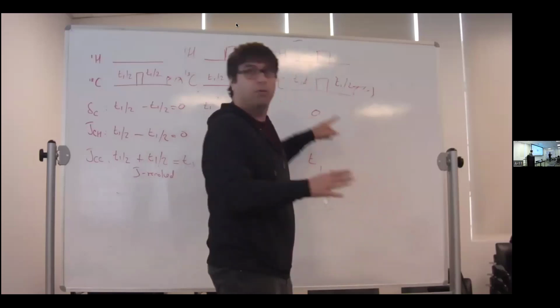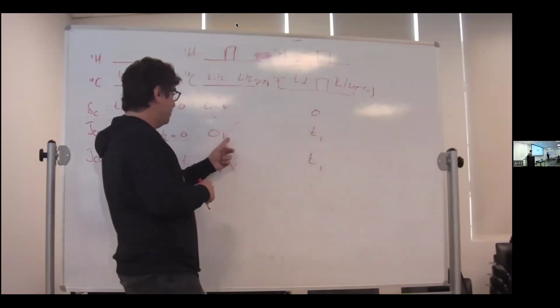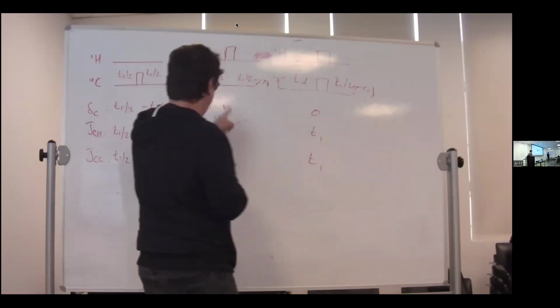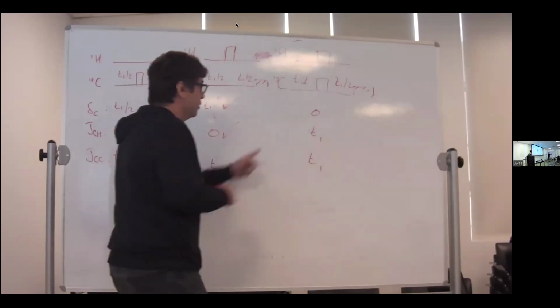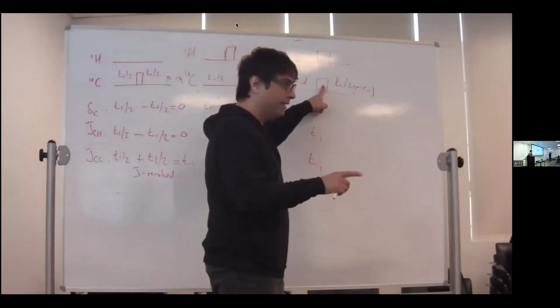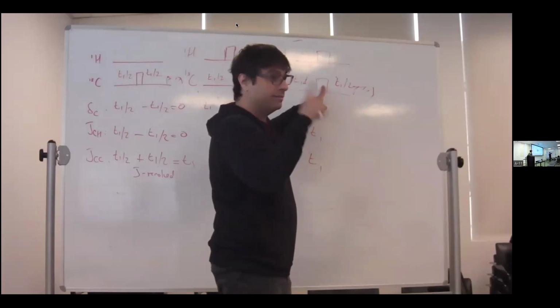No, we want chemical shift evolution. We want no CC coupling. We want CH coupling evolution or chemical shift, but no CC coupling. You're in the right direction. So this 180 should not be on your carbon or my carbon, it should be on the coupled carbon.